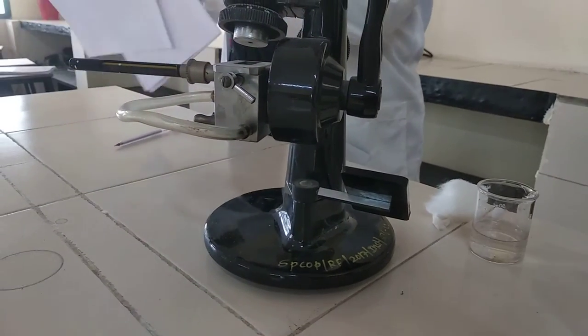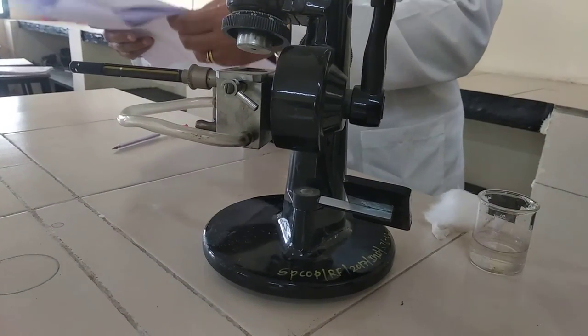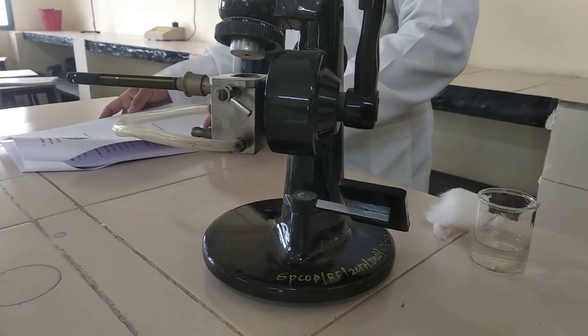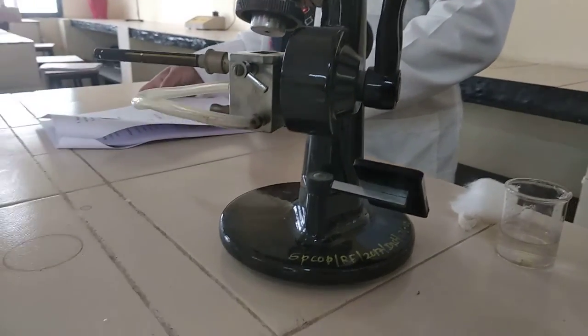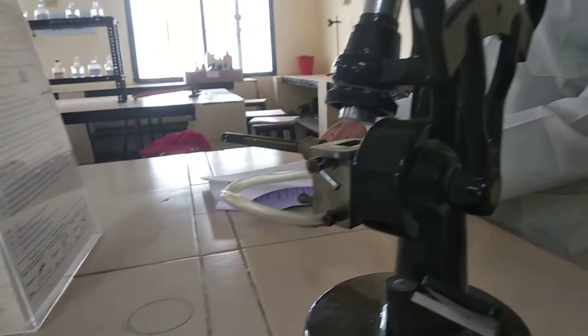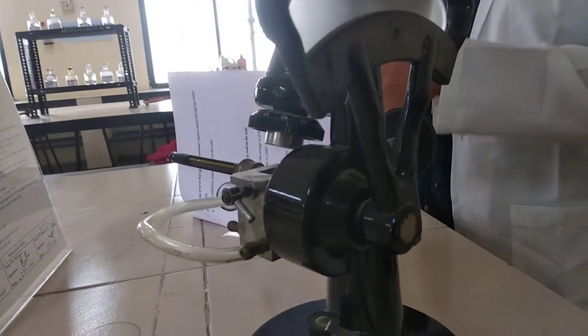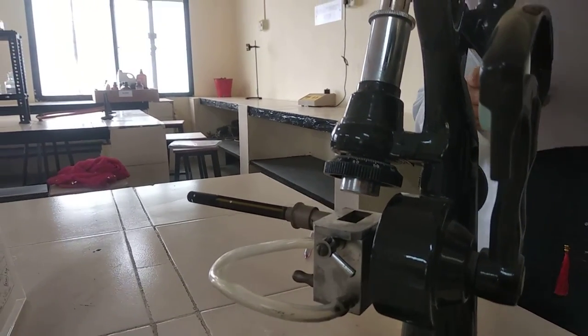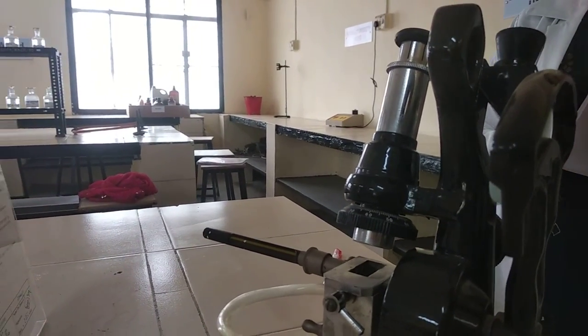Always take three sets of reading and find the average of all readings. For water, the refractive index is 1.333. Like this, we can easily find out the refractive index of various oils and various solutions.